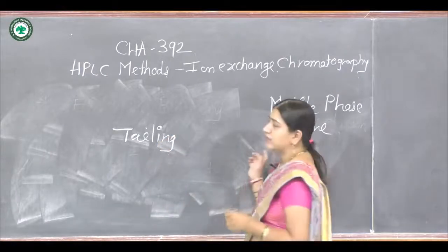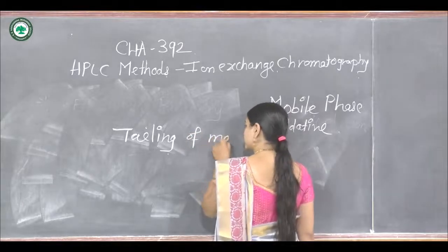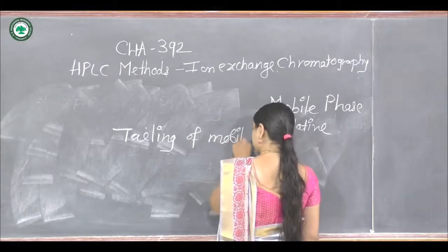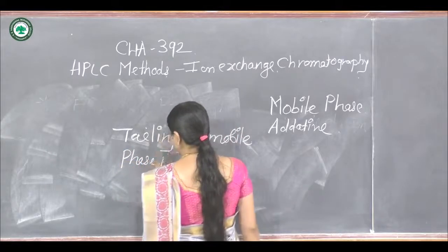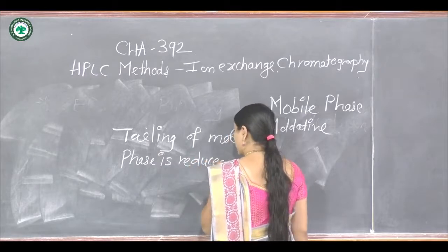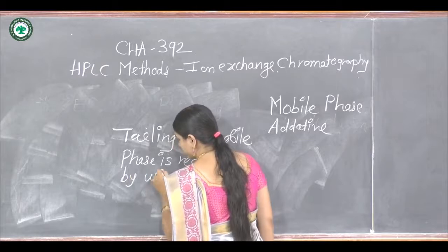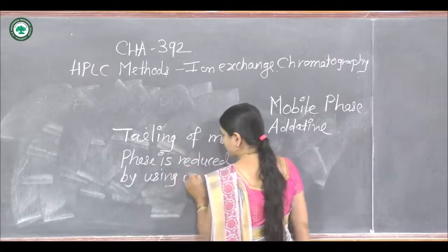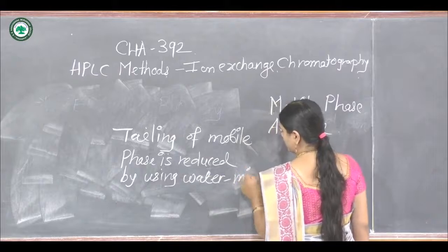Here, the tailing of a mobile phase is reduced by using water miscible solvents.